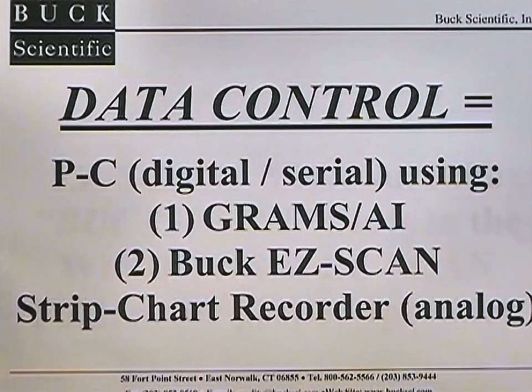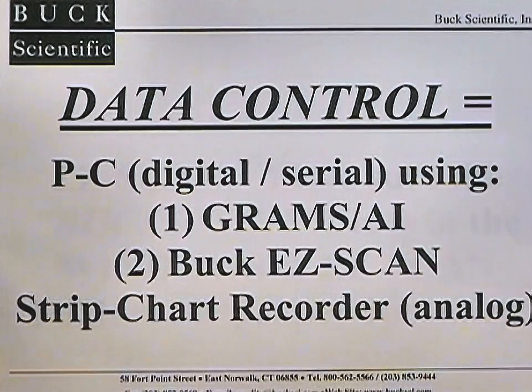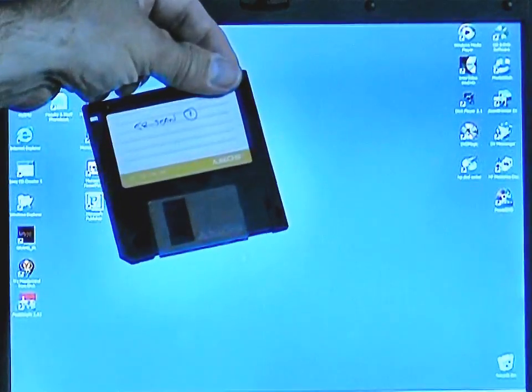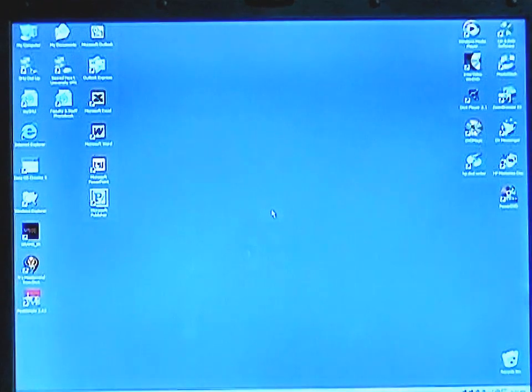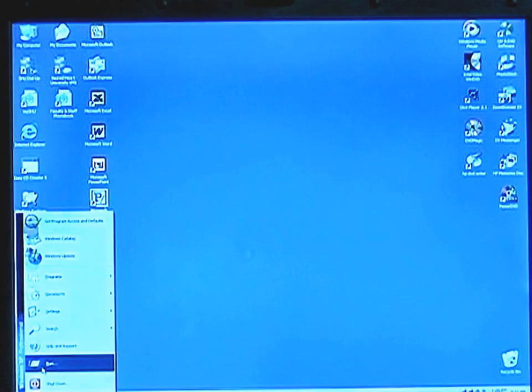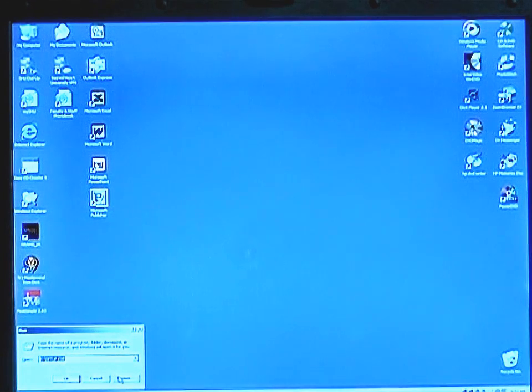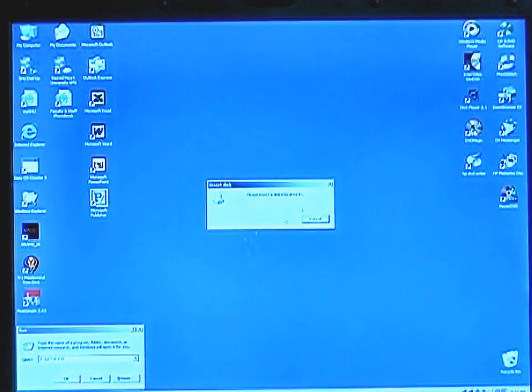The Buck M500 can also be controlled through the Easy Scan fundamental software package included with each instrument. The software must be properly loaded to ensure proper operation and communication with the M500. You will receive two disks for the Easy Scan software for the M500 IR system. Insert disk one into the drive.